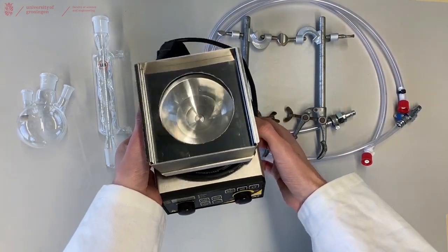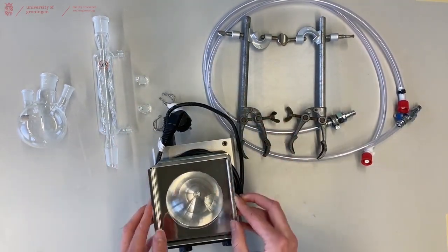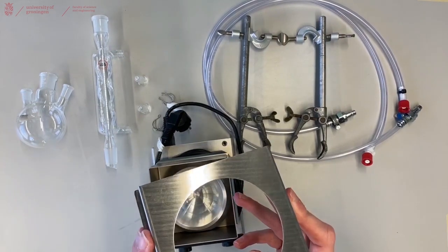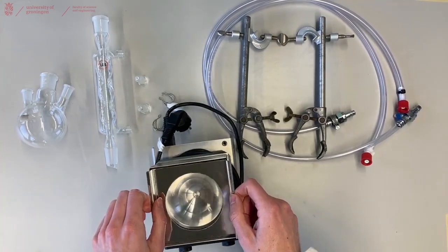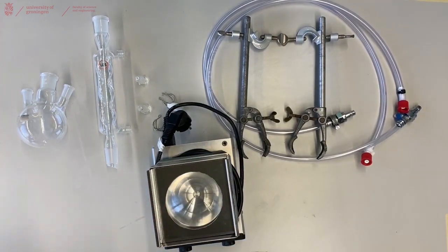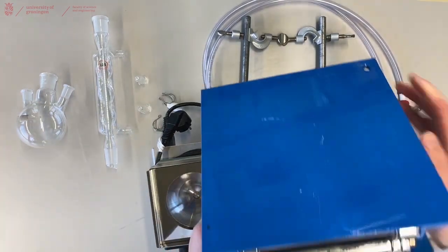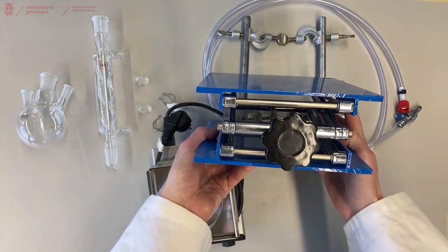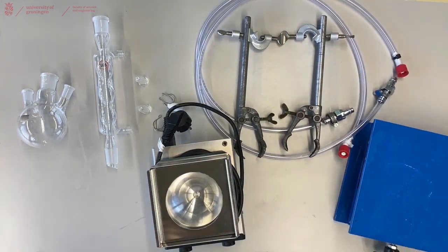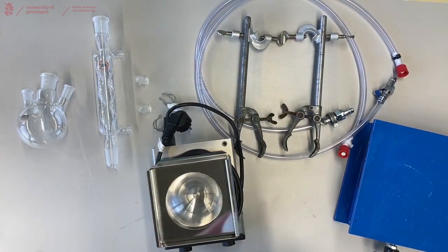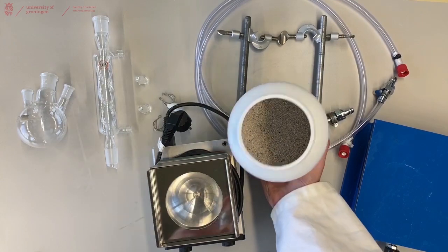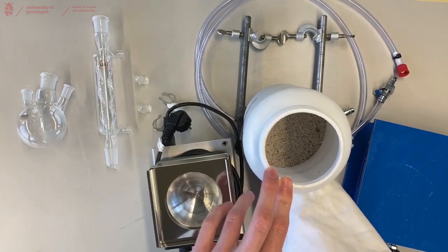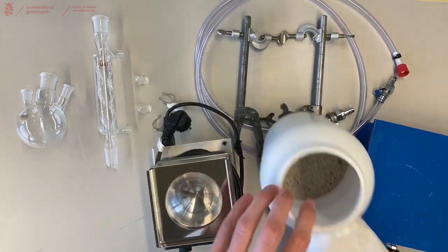You'll need one IKA heating mantle with a matching metal insert for the round bottom flask you're using, one lab jack, and sand for your IKA to improve conduction of heat between the heater and your glass.